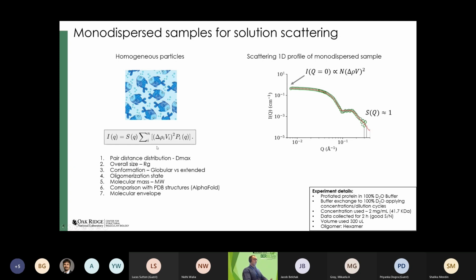So we can calculate mainly the intensity over Q. That gives you the scattering profile, the behavior of the scattering profile. We will look for samples that level off to a flat line at low Q, so we know that we have a nice Guinier regime to analyze, and I'm going to explain more about what this good Guinier regime is and the conditions for you to have it.